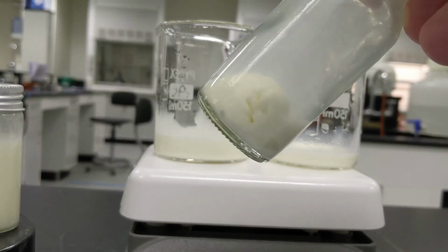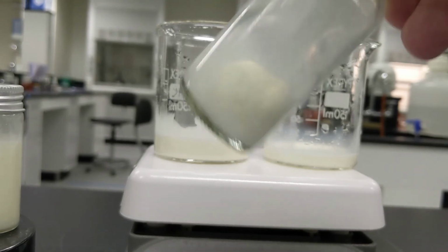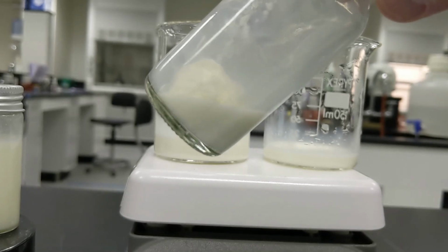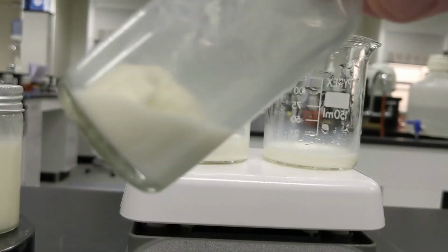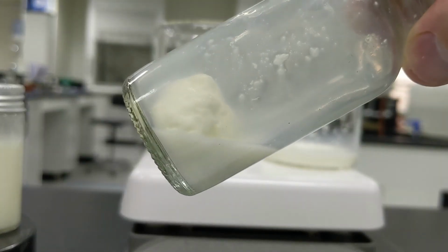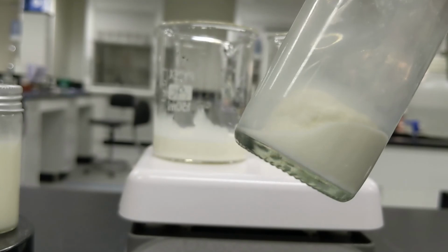Now there's a reason that this breaks the colloid. By shaking this so vigorously, I'm doing something to the particles to help break the colloid and turn it into a mixture of the solid and liquid. So you can see the liquid, but you can also see the solid. So I've done something, which is in your notes, to break this colloid.